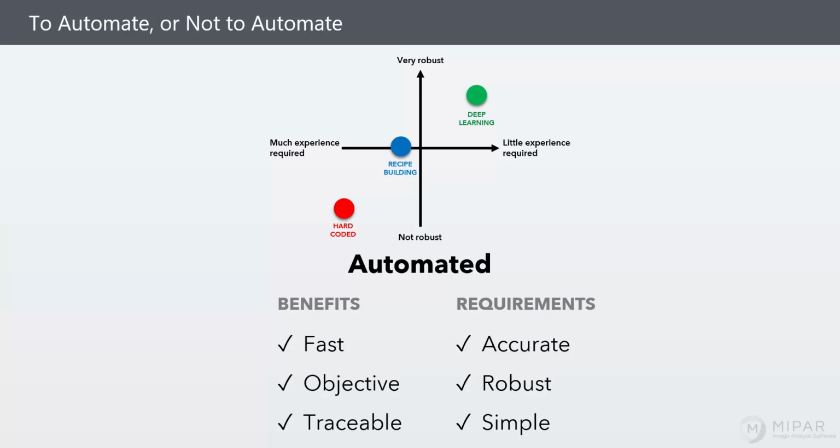It's really a privilege to be working at this time period where we've seen this breakthrough technology, which is rare to see, where you end up working with something that somehow allows you to develop even more sophisticated solutions while at the same time needing less experience to do so. That's almost a too good to be true scenario, but we have seen through our deployment of it that it is very much true. And that's what we're going to be taking a look at today.